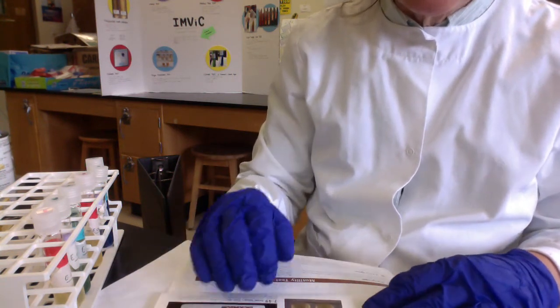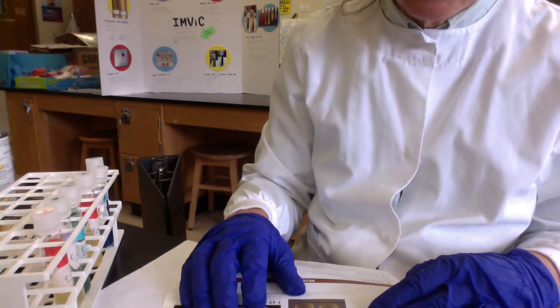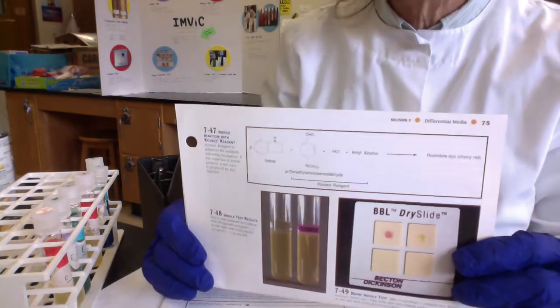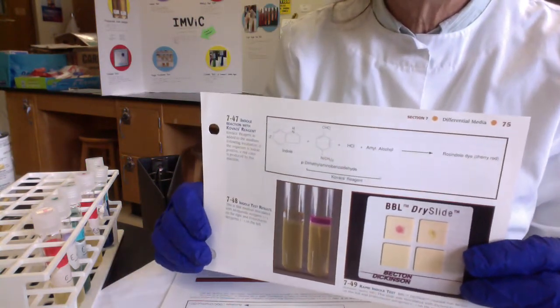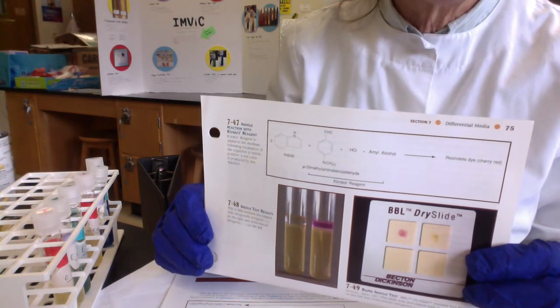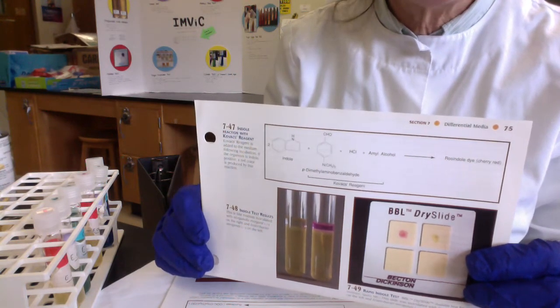So folks, let me just really quickly go through the indol test using our photo atlas. So folks, the indol test is a test for the ability of your microbe to make indol from the amino acid tryptophan. So really what we're trying to detect is, can your microbe make tryptophanase? Does it have a gene to make tryptophanase?